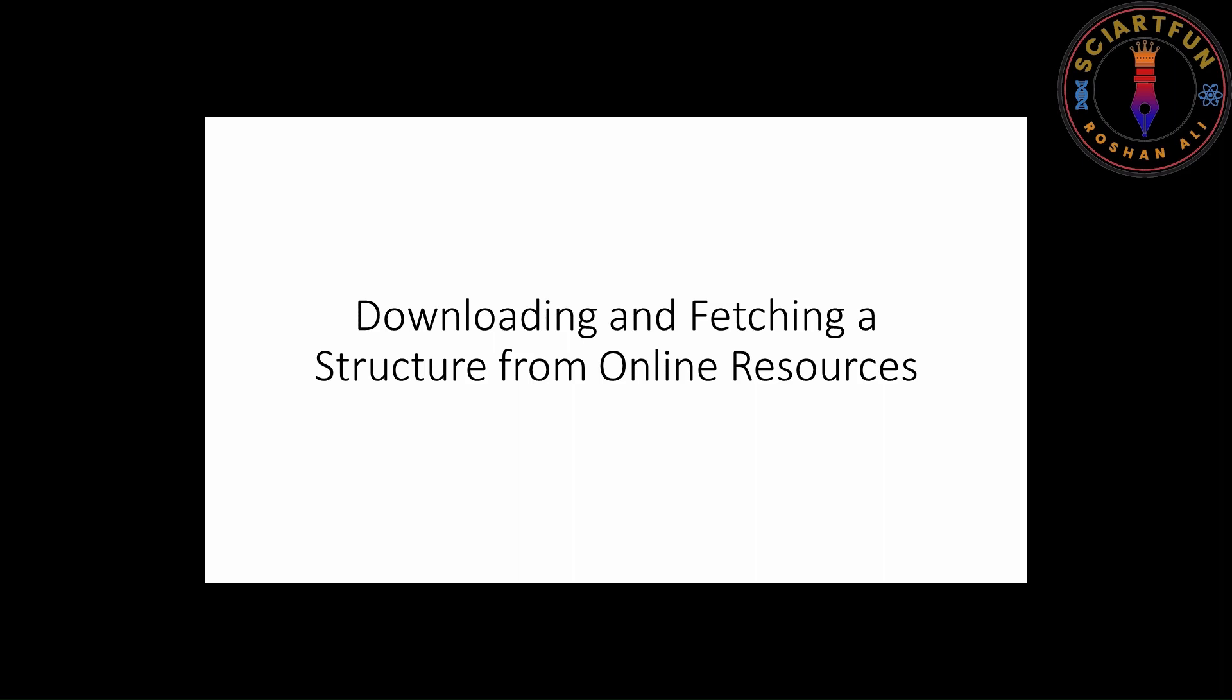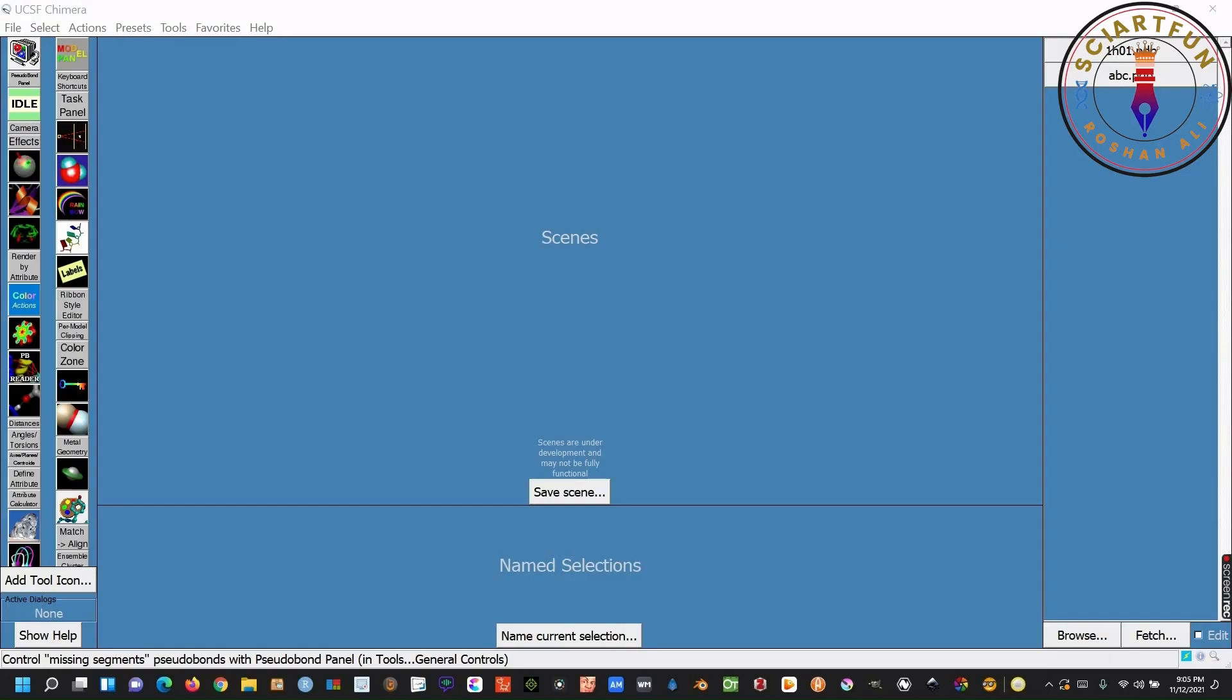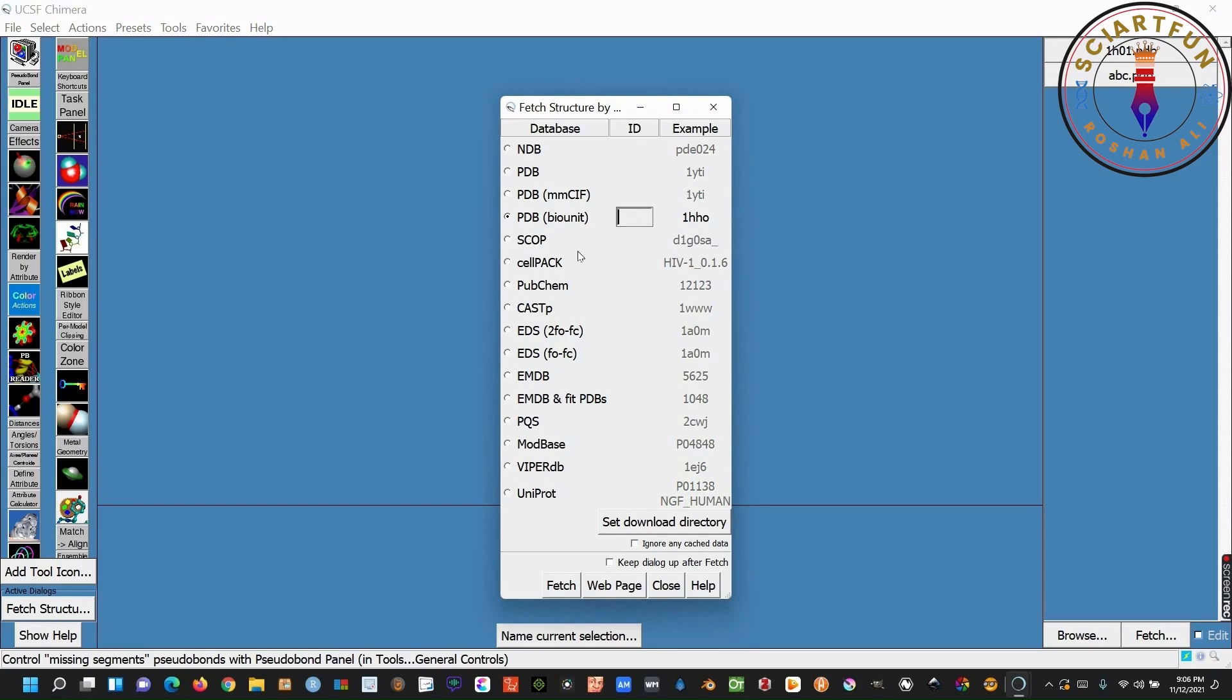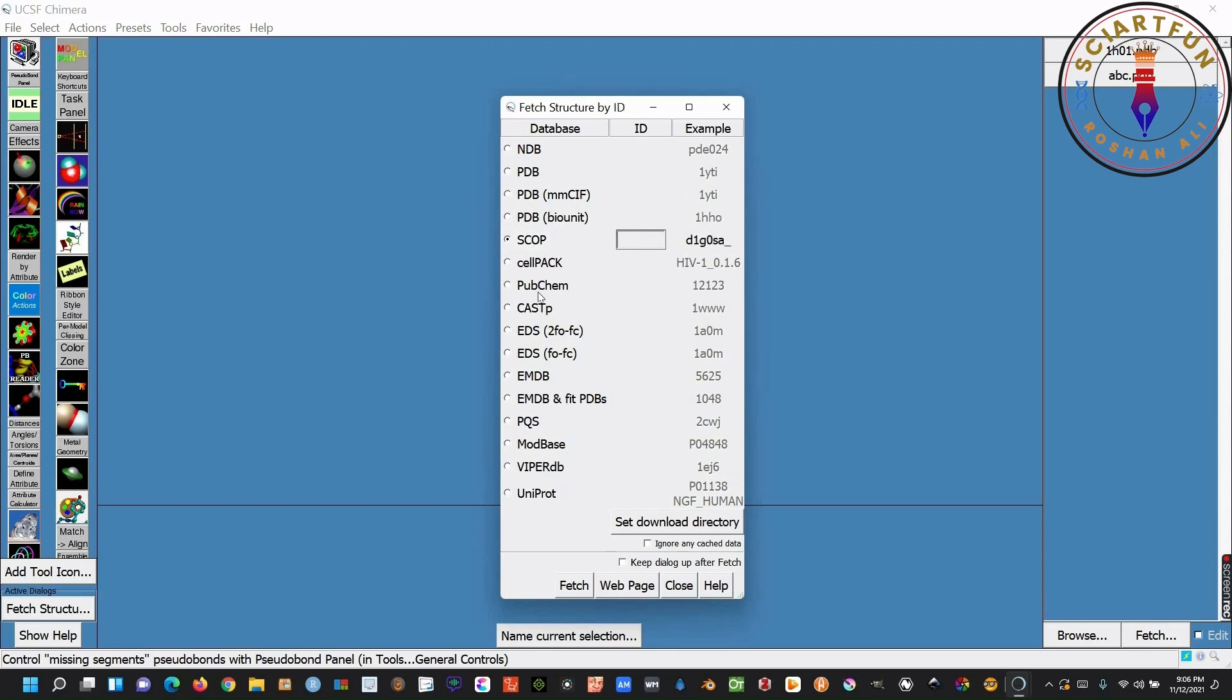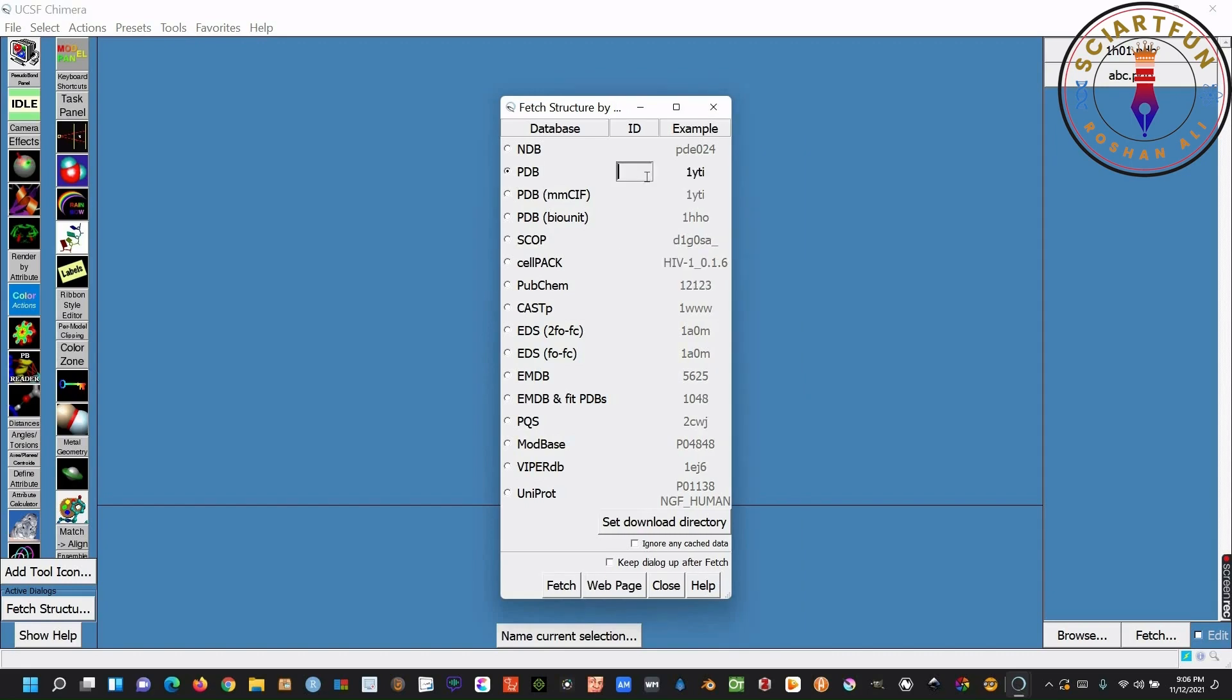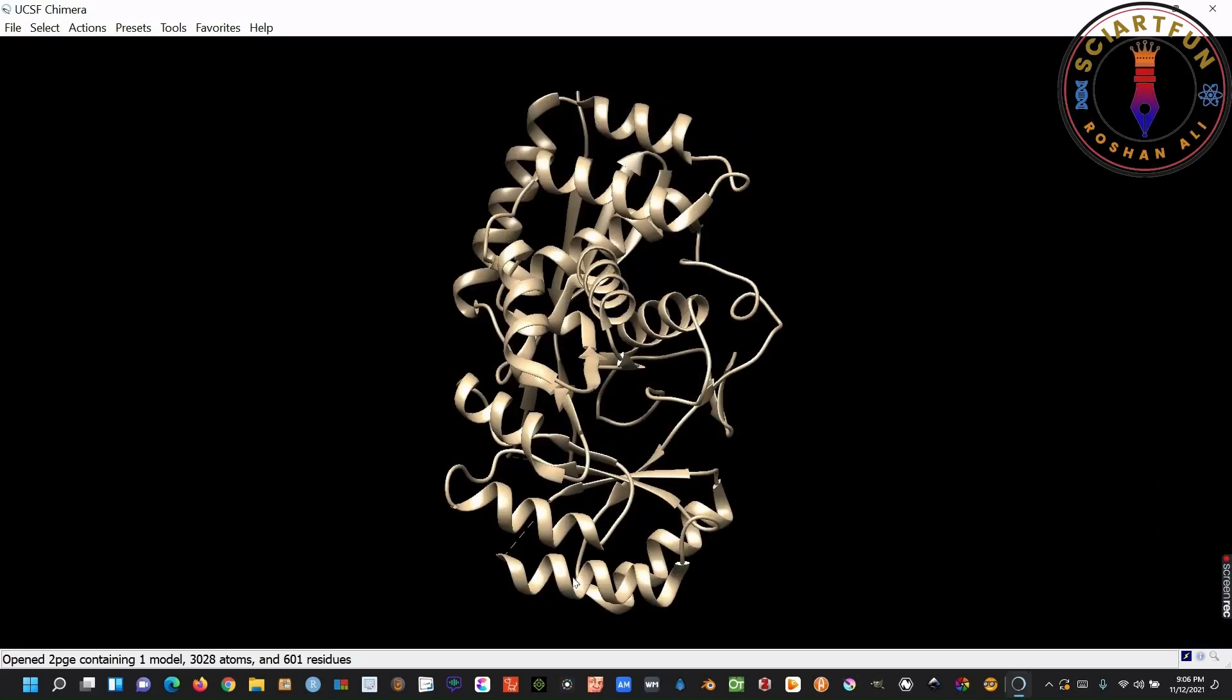Now, let me show you how to download and fetch a protein structure from online resources. To achieve this objective, you have to click this fetch button. Here is the list of online databases. You can download your structure from any database, if you know the code or ID of the structure in that database. I will show you how to download the structure from PDB. Just type your code here and then click on fetch. Here is the structure.